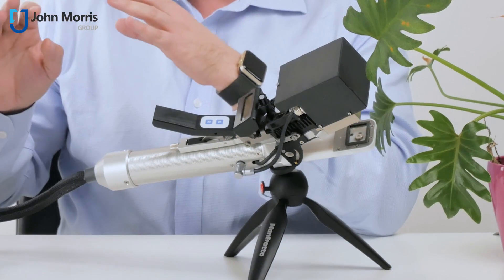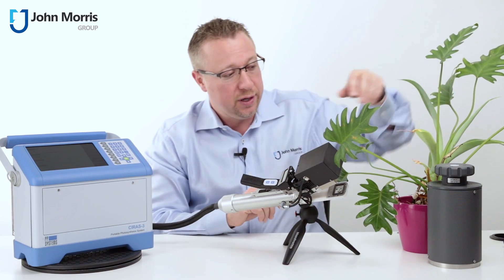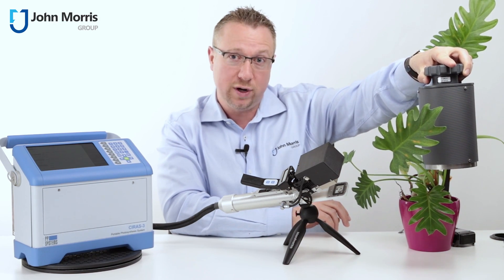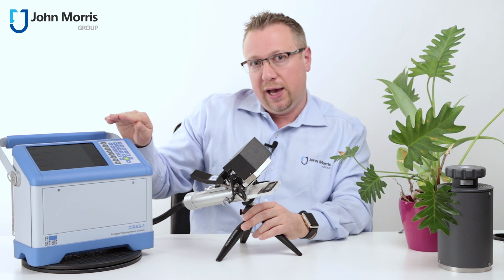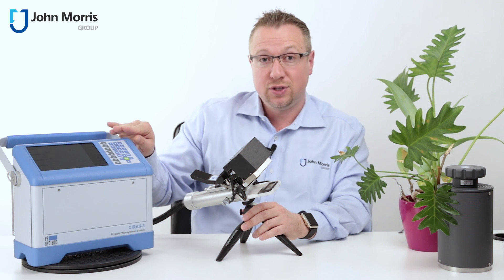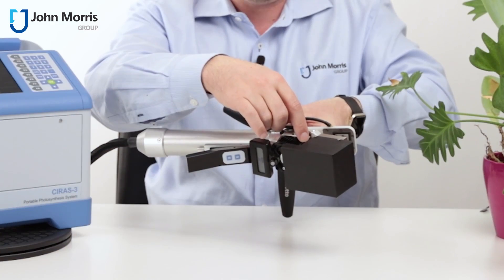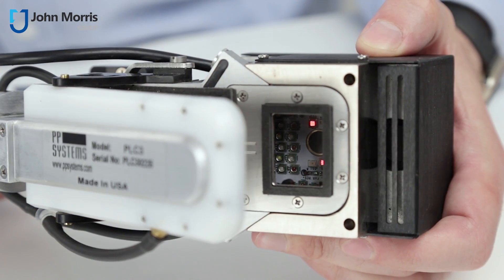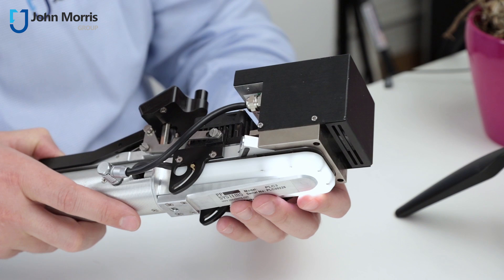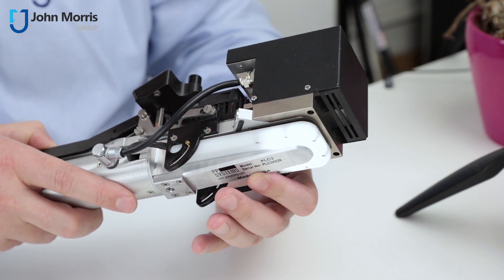With the addition of the CFM module like you see here, you can actually do chlorophyll fluorescence measurements. One of the nice things about the Cyrus 3 is that you can combine it with this particular device right here, which enables you to do soil respiration. The Cyrus 3 allows us to control four main variables: H2O or water, CO2, temperature via the Peltier control right here, and light via this control unit here. And when I close these two together, we create the seal for that small chamber we were talking about. You can also see now the light source shining through the bottom because we don't have a leaf inside that chamber.